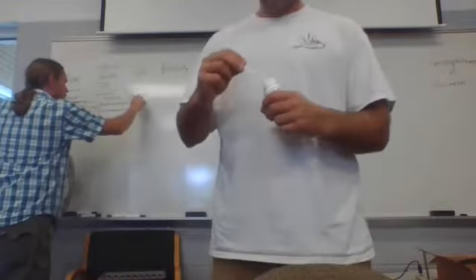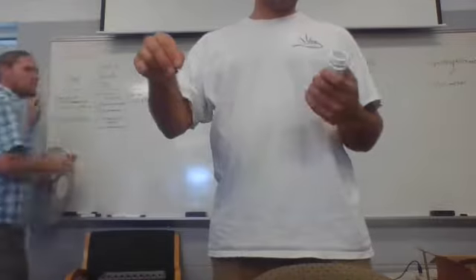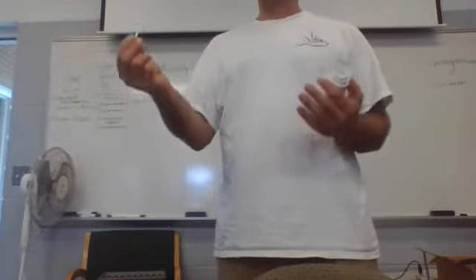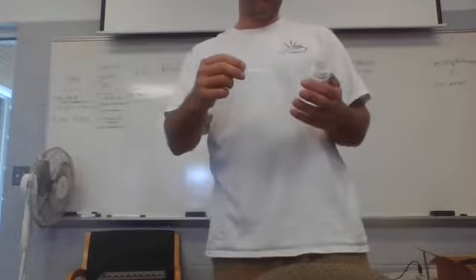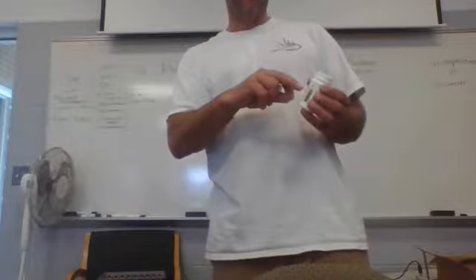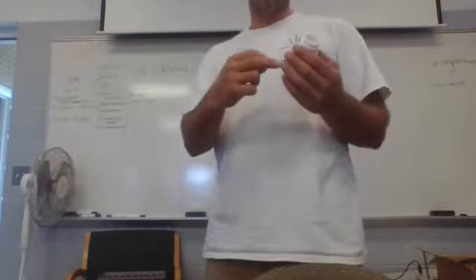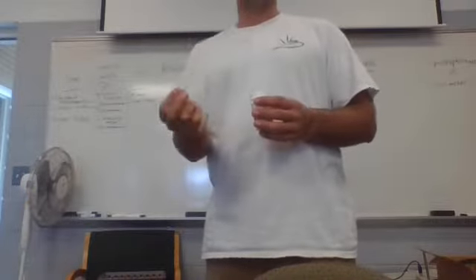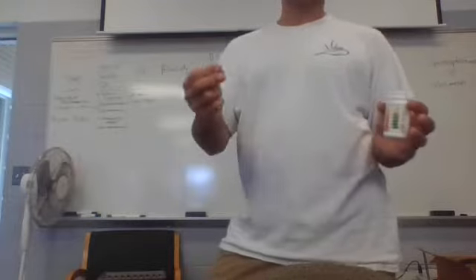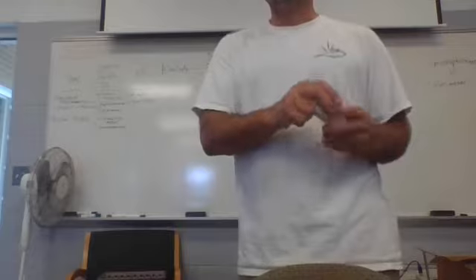So this is the idea of a little strip. Usually they have maybe not high resolution measuring, but people use them for your pool or whatever to figure out what range they're in. The scale on this one for pH is every 0.5, so it's 6, 6.5, 7, and it only measures between 6 and 9. So you don't get a lot of high resolution with this, but you can check that you're not pouring straight acid into something, I guess, or whatever. What else?